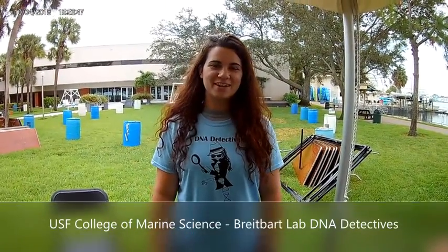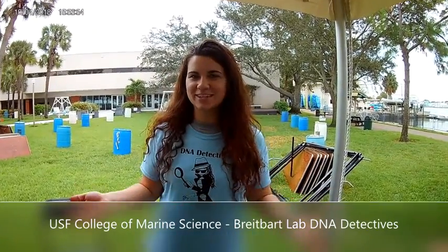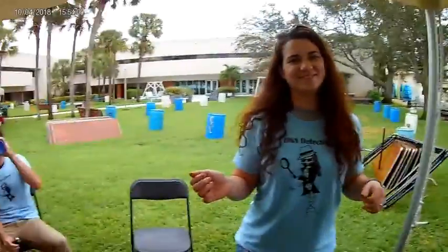Detectives booth. Today we're going to be learning about how to use DNA to identify different organisms in seawater. So we're most interested in fish eggs. Does anyone know or have ever seen a fish egg before in the water?